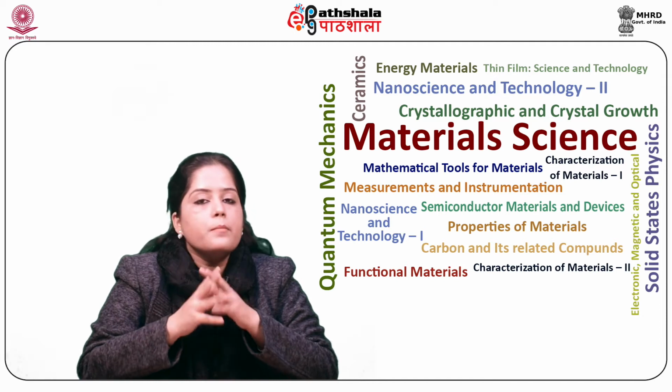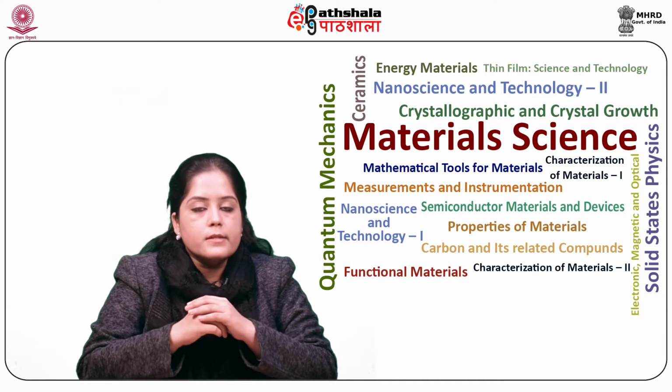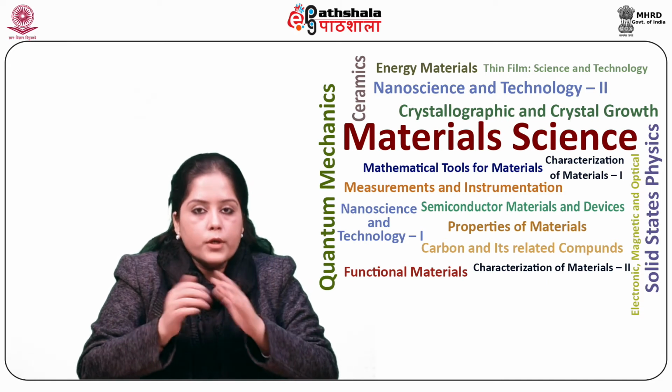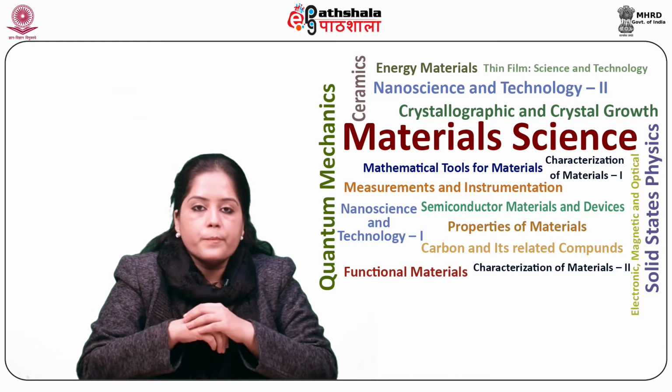Ferroelectrics are a subclass of piezoelectrics, namely materials that experience mechanical deformation under applied voltage or charging under mechanical force.